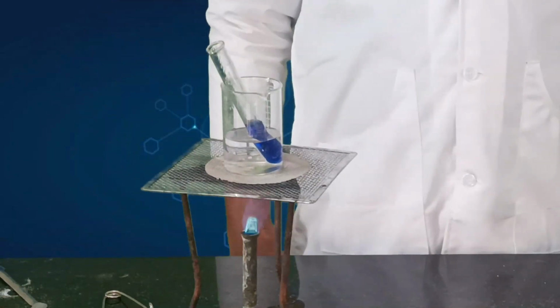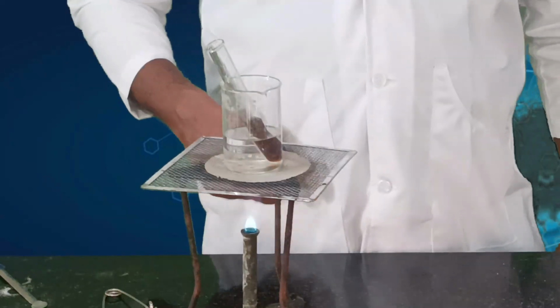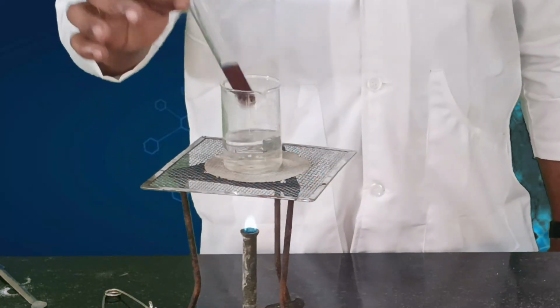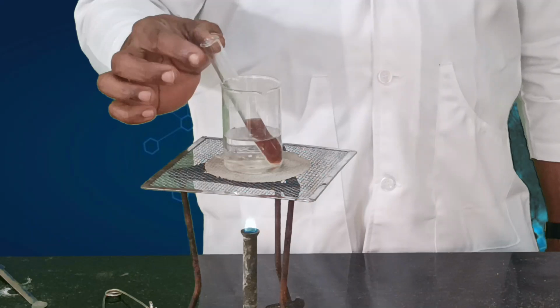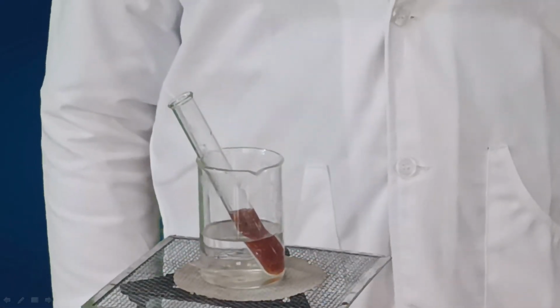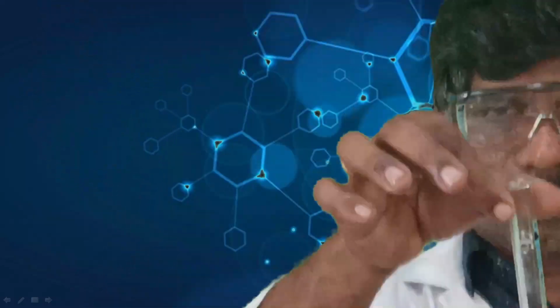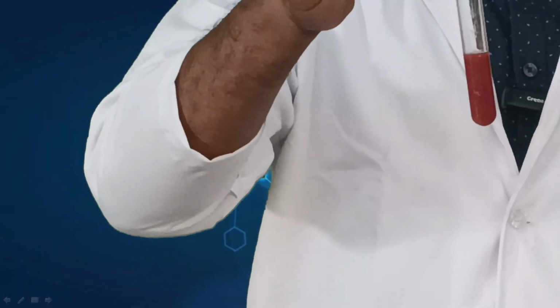Now place it in the water bath for 10 minutes. Now you can see the blue solution turning into brown or red color. Okay, the formation of red color shows the presence of a carbohydrate. You can see this color shows the presence of a carbohydrate.